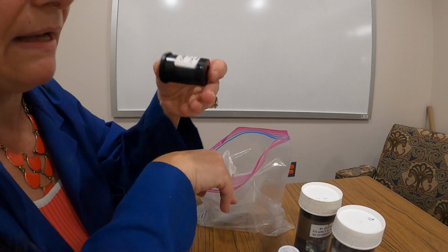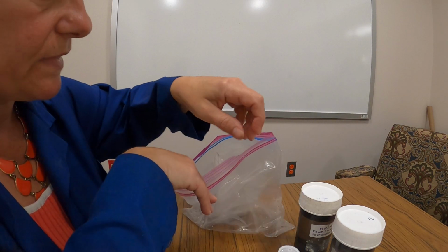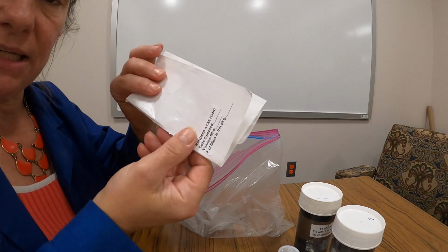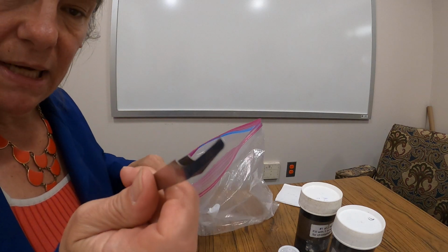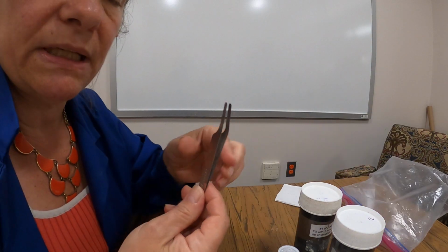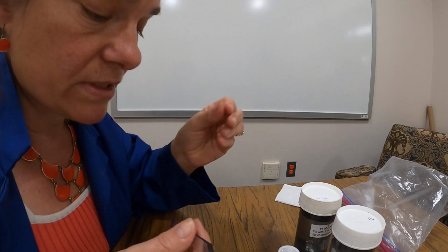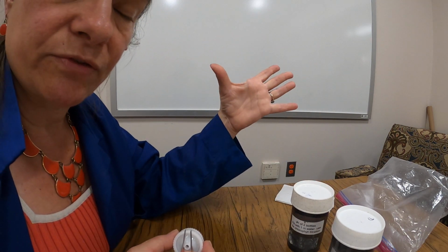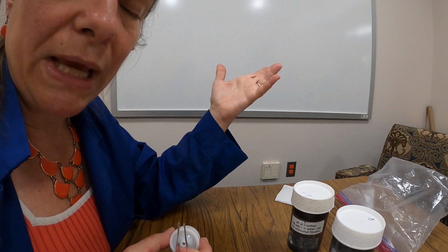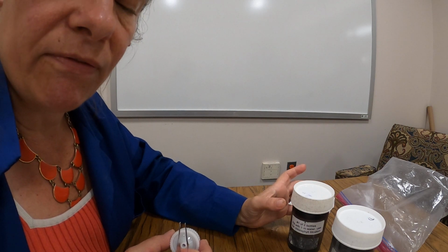You'll have a film canister with chlorophyll filters in it. You'll have a sheet of labels, and you'll have forceps. And that's to remind us that we want to be doing this using the forceps because the oils on our fingers can actually degrade the chlorophyll, make the value lower. So again, out of direct sunlight, no wind, no bright light, we're going to set up our filters.